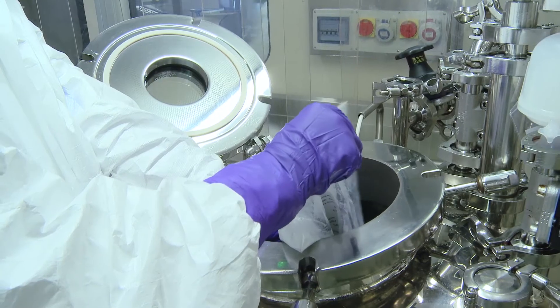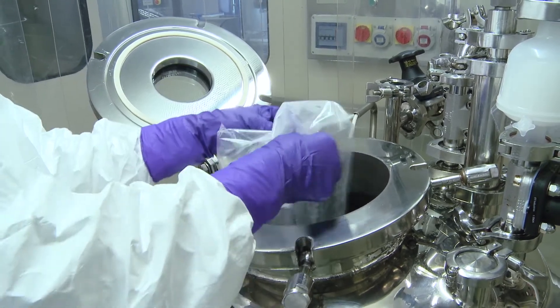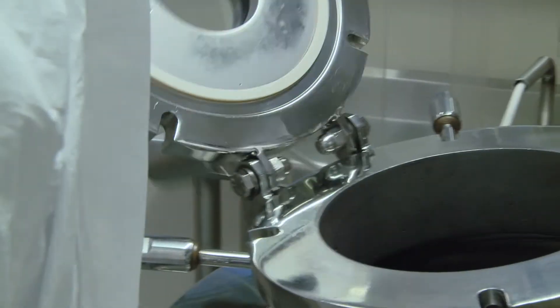The high quality of raw materials is assured by a meticulous sampling scheme to analyze their physical, chemical, and microbiological characteristics.